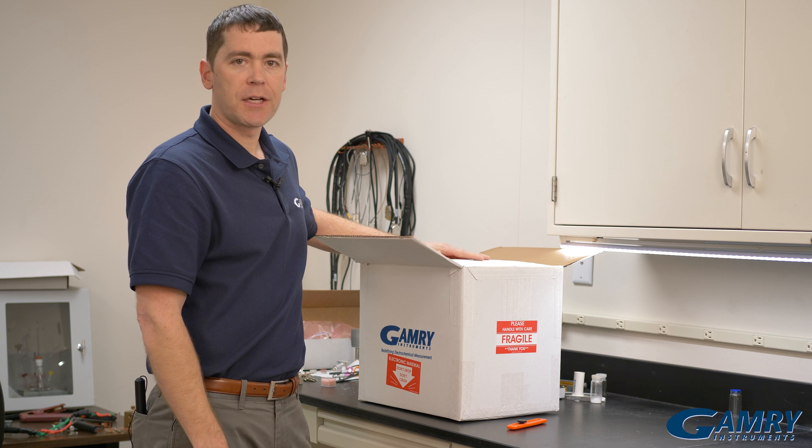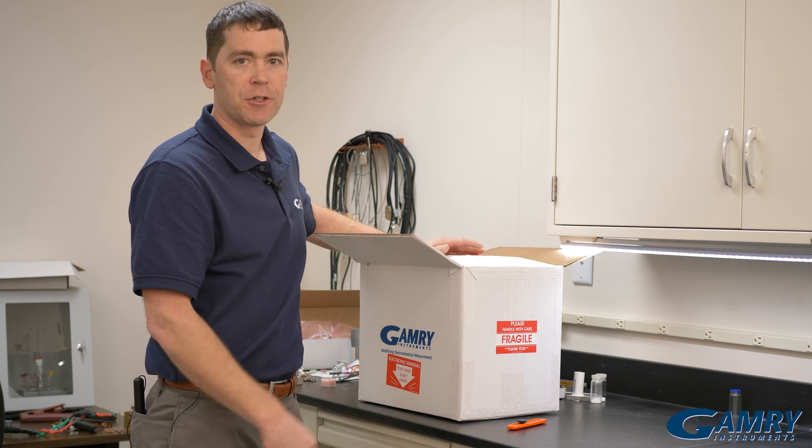I cut this box open with a simple utility knife, and now I'm going to open it up and show you what's inside.